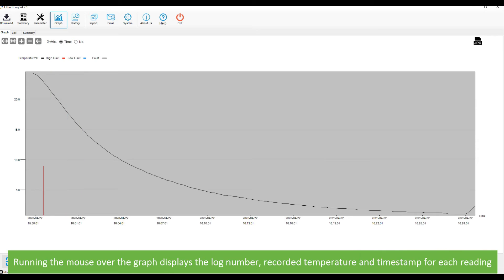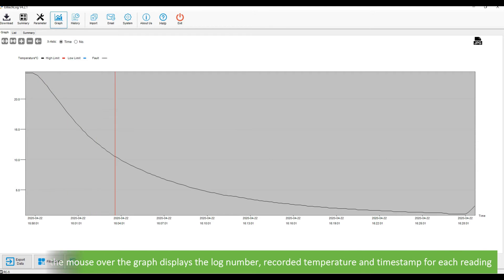Running the mouse over the graph displays the log number, recorded temperature, and timestamp for each reading.